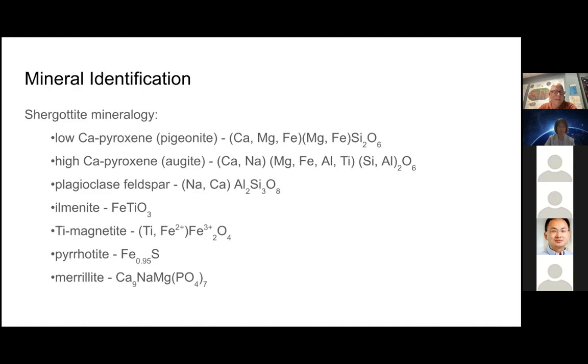We can make these element maps for any number of different elements, I believe currently from the spectrum as light of elements as lithium to as heavy of elements as uranium. But we ideally want to choose elements that are in measurable abundances, but also reflective of the overall chemical composition of a number of the species.